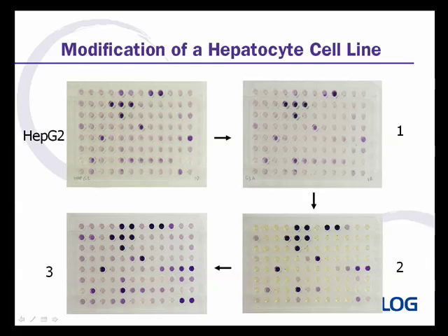Although many cell lines will be metabolically stable when maintained on the same culture medium, it is also possible to alter the metabolic properties of cells in culture. In this instance, the liver cell line HepG2 underwent a series of selective media adjustments to bring its metabolic phenotype more closely toward that of a normal hepatocyte. Many carbon energy pathways have been successfully activated.